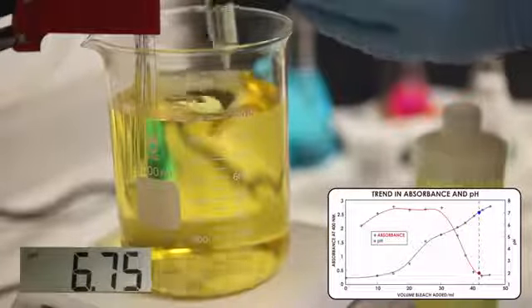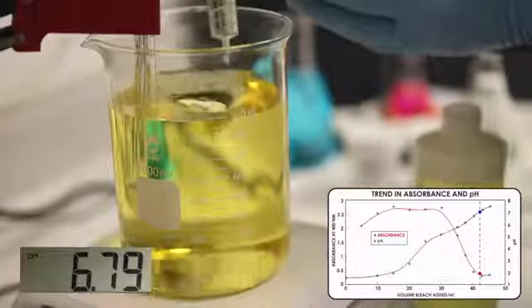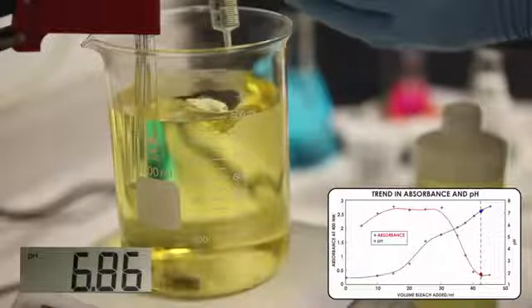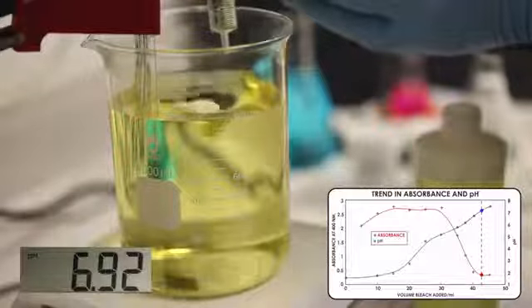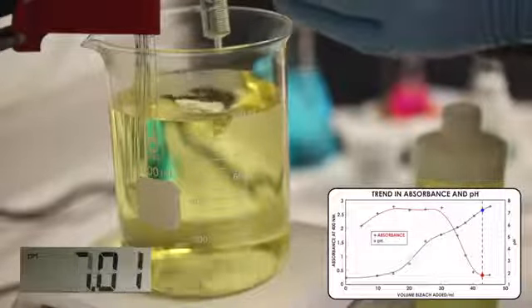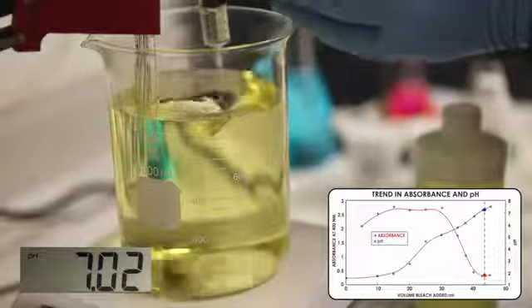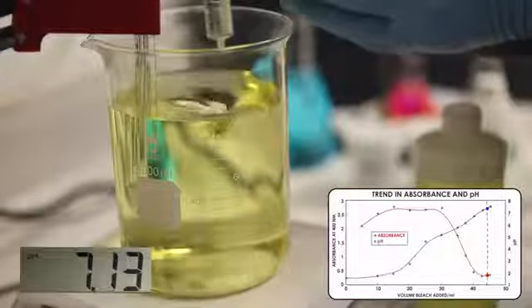This activation is taking place slowly, on a batch basis, so that the pH and absorbance transitions can be observed as we understand the chemistry occurring. Obviously, this batch activation is impractical on the plant level, but there will be a demonstration of a fast activation a little later on.